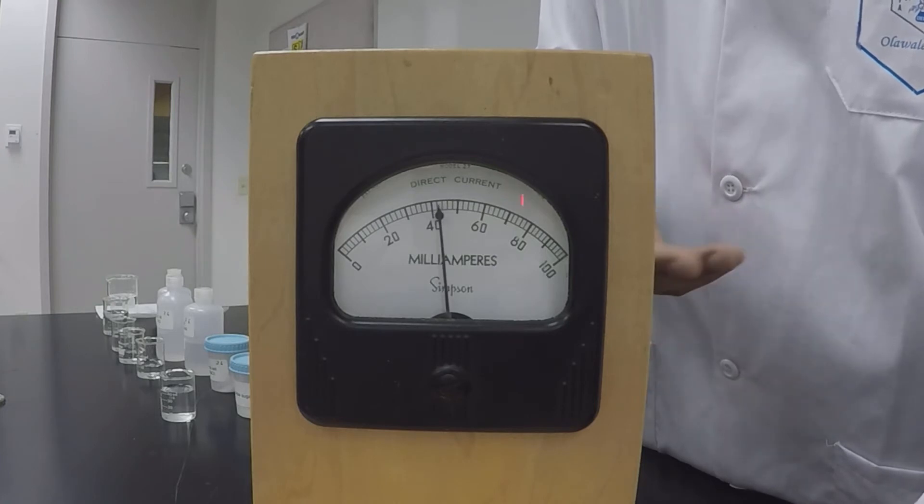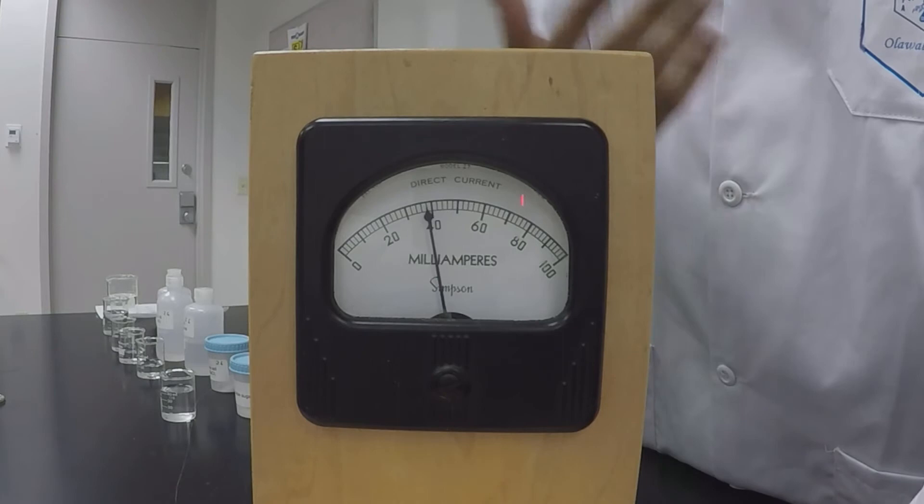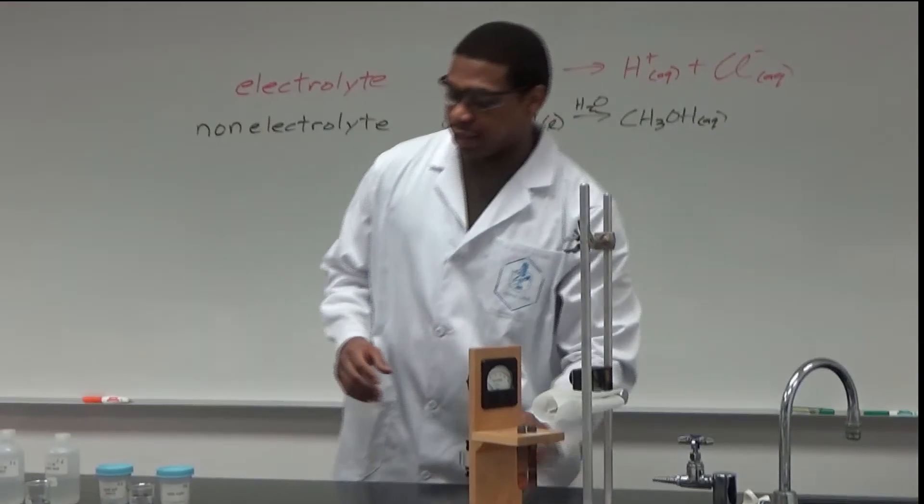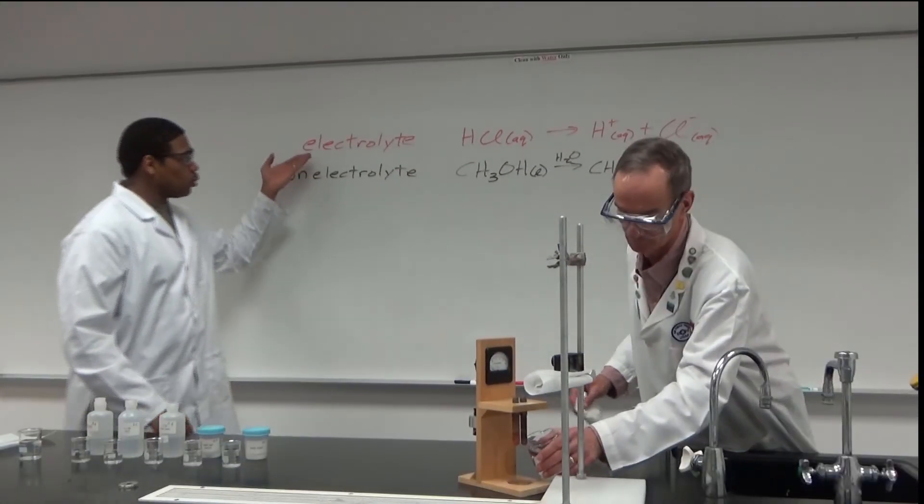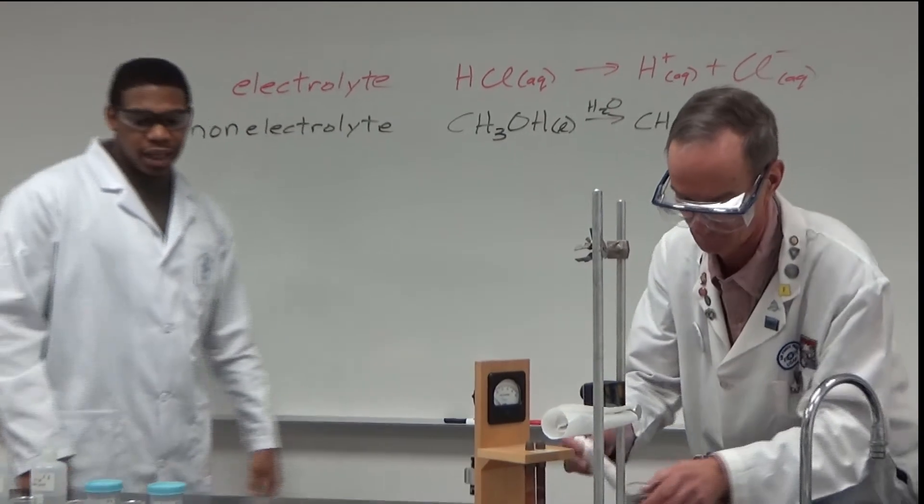As I place this into the meter, you should see the arrow spike up, indicating that this is in fact a conductive solution. Again, conductive solutions we call electrolytes. Non-conductive solutions we call non-electrolytes.